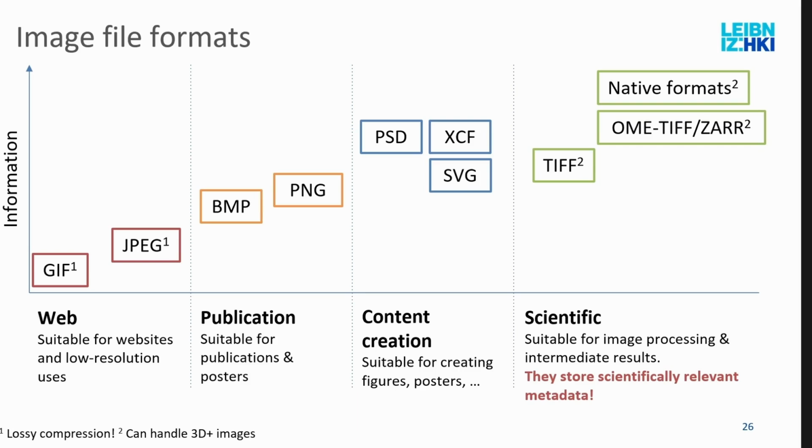But when you're actually doing science and still processing the data, and it's not yet anything that should be published or go on a website, then if nothing else is available, just use TIFF, because TIFF can hold a lot of information thanks to its metadata system. I will explain in the next slides how it actually stores images.